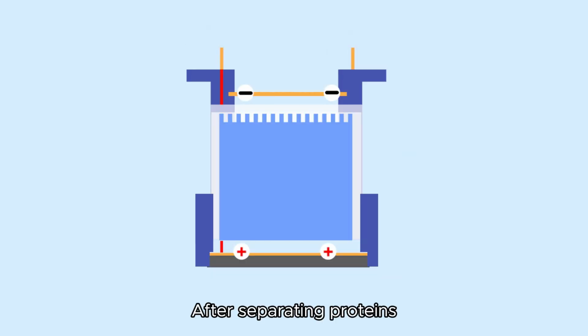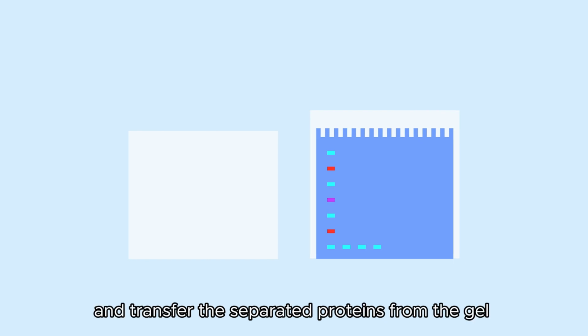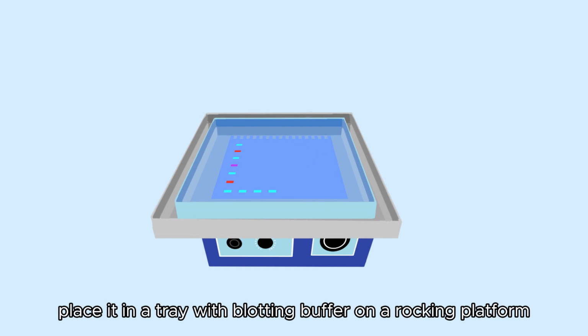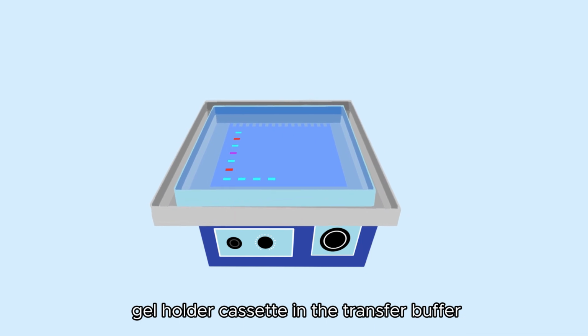After separating proteins, remove the gel cassette from the electrophoresis tank. Take off the glass plates, cut the top portion with the wells, and transfer the separated proteins from the gel to a membrane. In wet transfer, equilibrate the gel in transfer buffer, place it in a tray with blotting buffer on a rocking platform, and create a blotting sandwich by immersing a gel holder cassette in the transfer buffer.